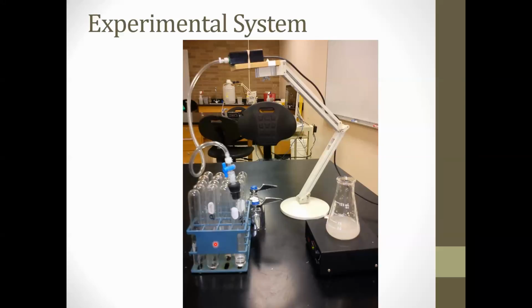The basic setup this week will use a pressure probe, a gas pressure probe. You will have some yeast. Yeast will be our model organism. It's a great organism for the study because it's easily available, and it's a eukaryotic cell that encounters oxygen on a regular basis. Therefore, it has peroxisomes that contain catalase, and we will be reacting that yeast with hydrogen peroxide and measuring the gas pressure produced as that oxygen is liberated from the reaction.